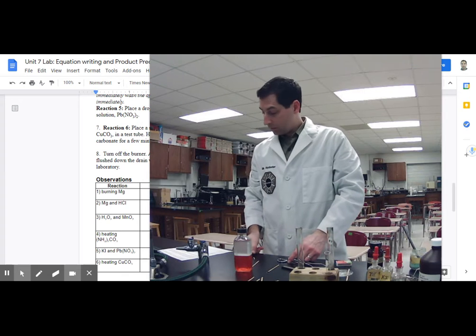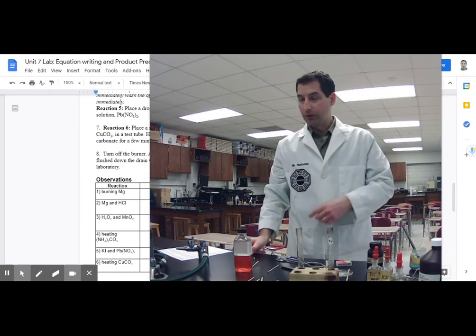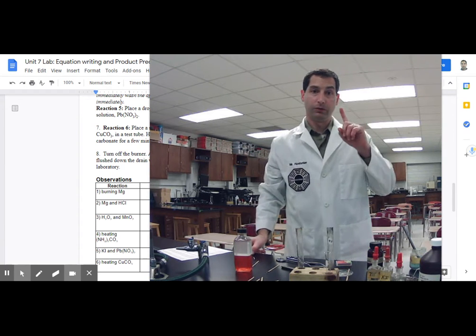Next, we're going to heat some ammonium carbonate, and I forgot to bring that up here. It's in a few minutes, so I'll be right back with that.